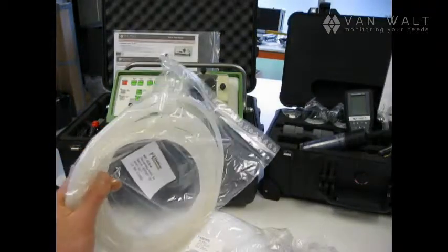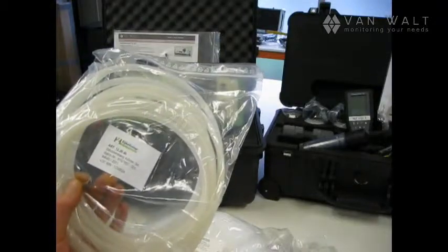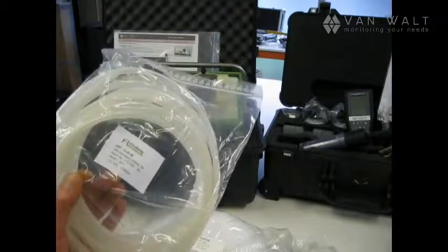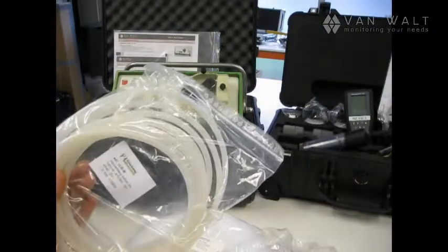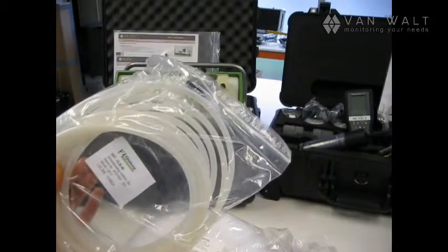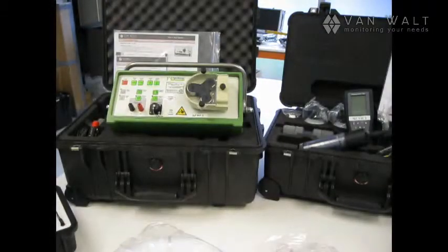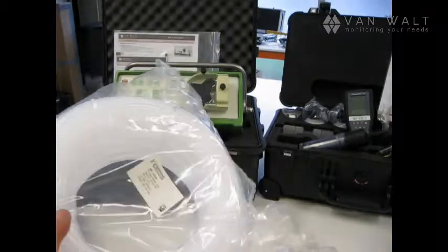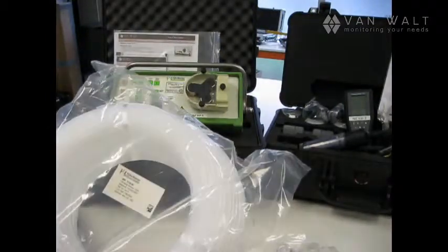We have two types of this, smaller and larger. What I'm holding here is the smaller tubing. This is 4x8mm and this in conjunction with our pump will lift groundwater from nine and a half meters and the correlating PE sampling tube as well and this is 4x6mm.